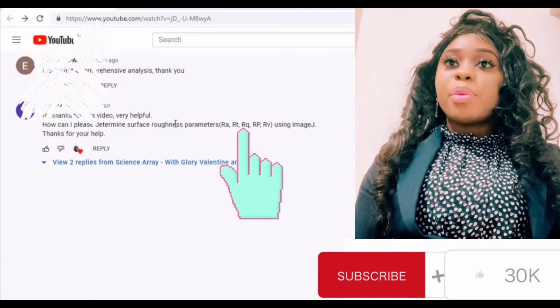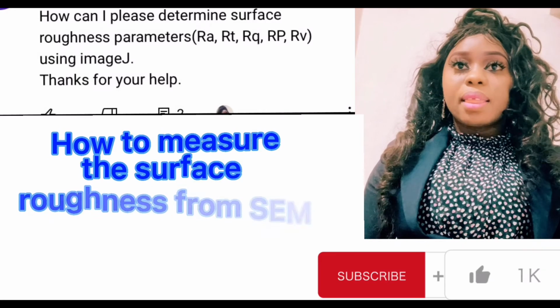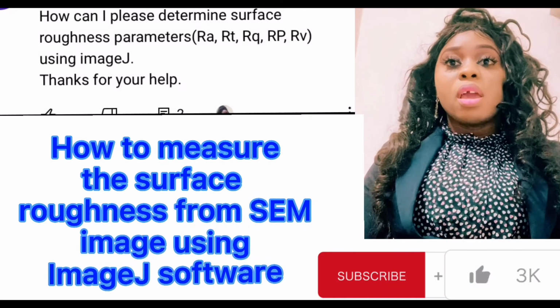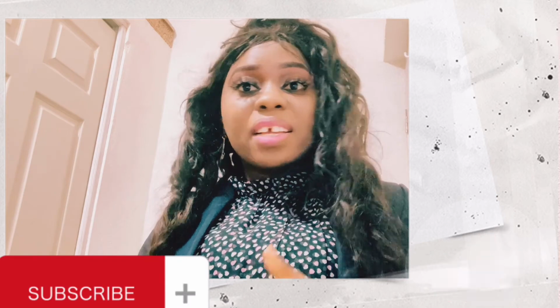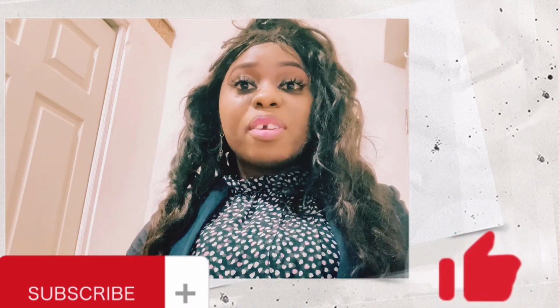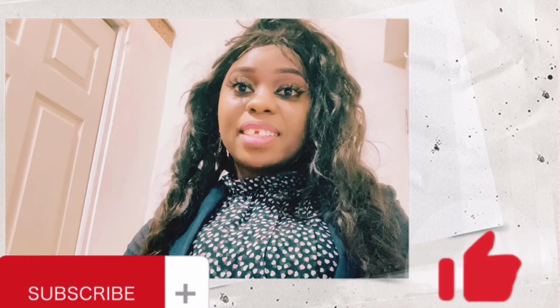Today, I will be answering a question from the video which I published titled How to Measure the Surface Roughness from Scanning Electron Microscopy Image using ImageJ software. The calculation is very easy and it doesn't take time. I believe it will be beneficial not only to the person that asks the question but also to researchers in biological sciences and physical science.